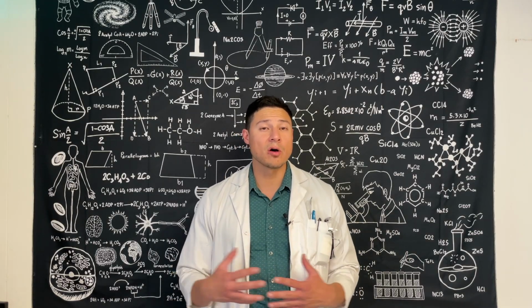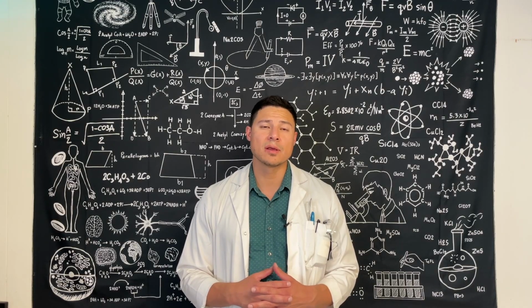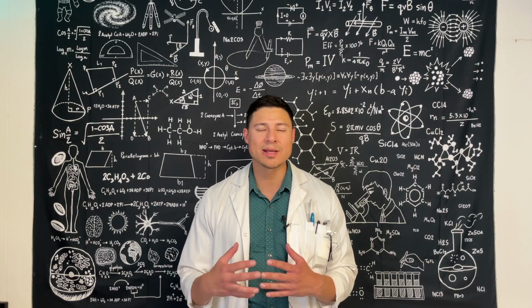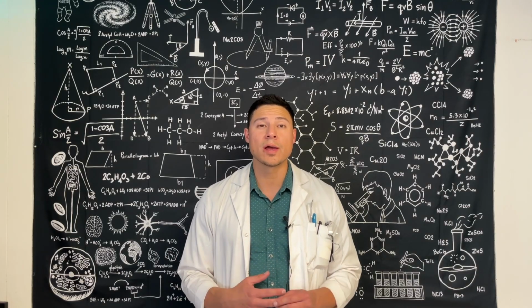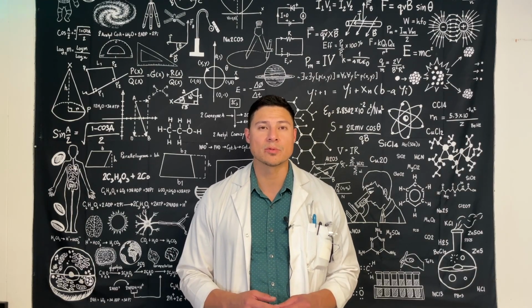Once you have collected all the evidence for this experiment, then go ahead and try to determine a trend. See if you can determine a trend to where the most reactive metals are on the periodic table.